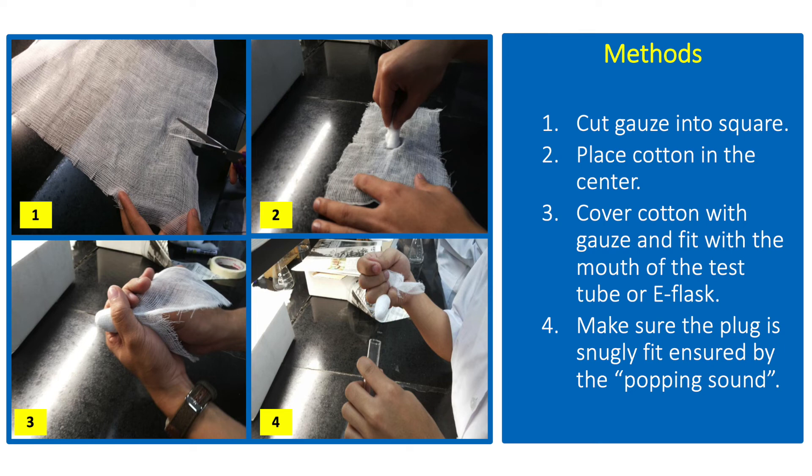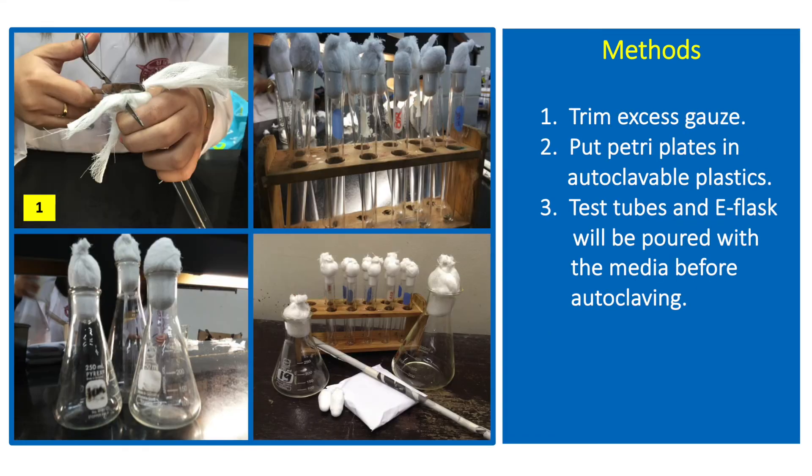To ensure this, you can adjust the amount of cotton until it makes a popping sound once pulled from the test tube or flask. After getting the proper fit, tie and cut the excess gauze from the plug. Additionally, aluminum foil can also be used to cover the cotton plugs before putting them in the autoclave. Wrapped petriplates are put in an autoclavable plastic before sterilization.